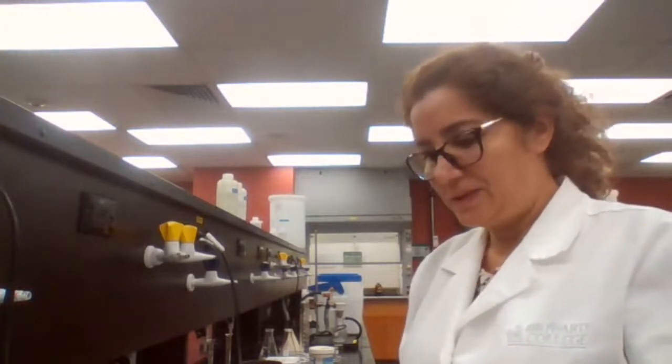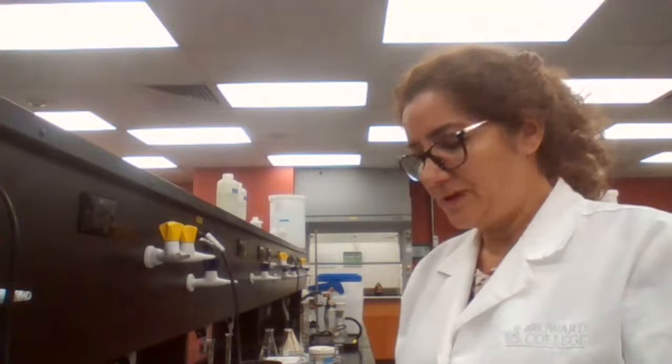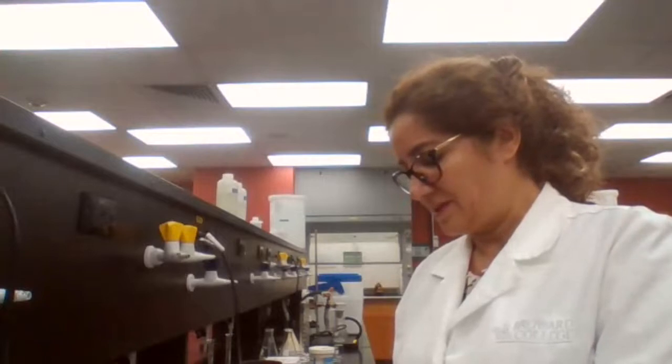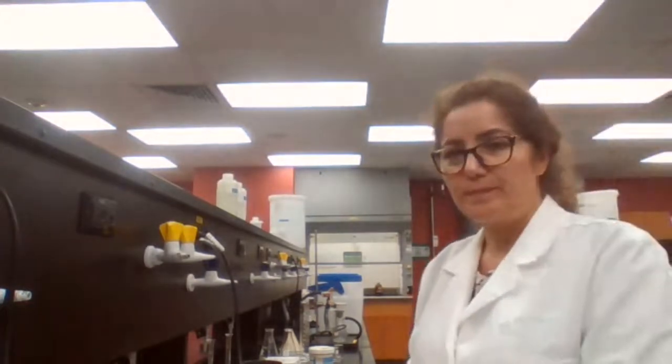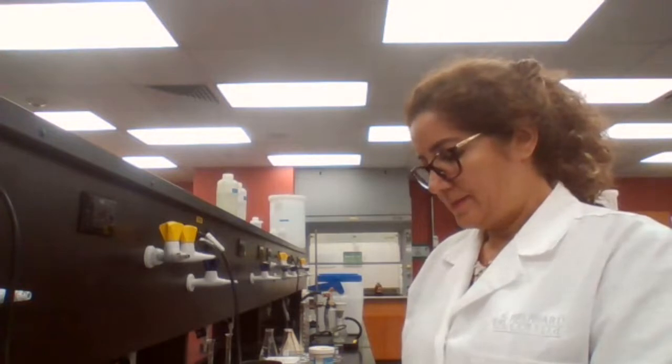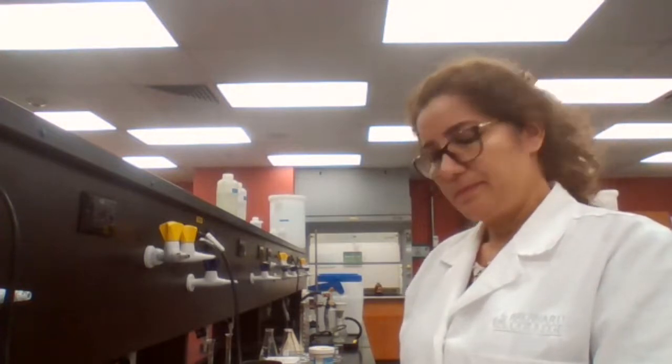For today's experiment, the title of the experiment is recrystallization. Can you tell me what is the purpose of the experiment? Why do we have to do recrystallization? What is the purpose of recrystallization? Purpose for recrystallization: purify a crude product.